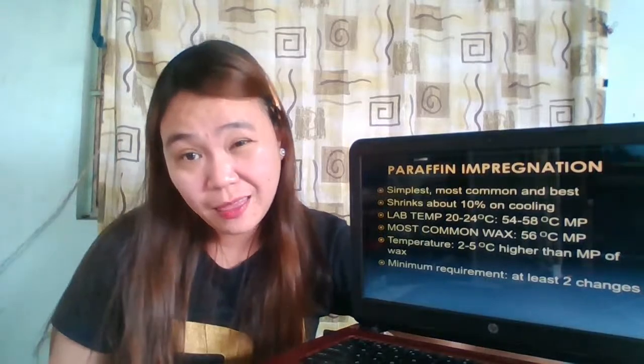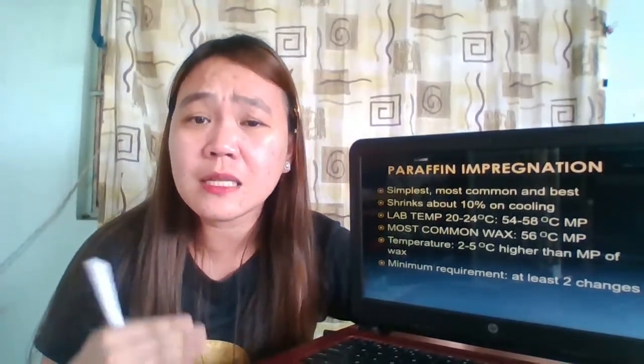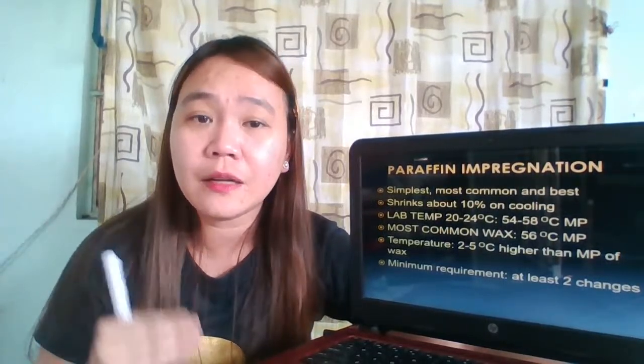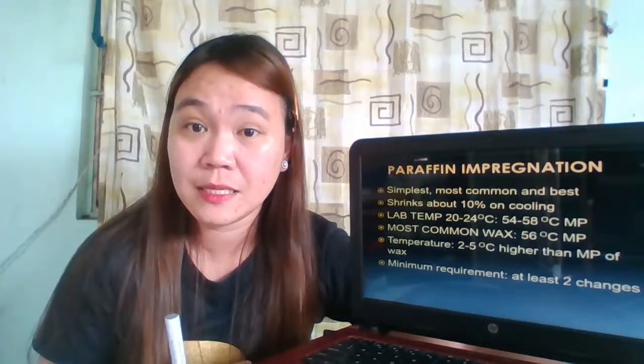That's incomplete, because 2 to 5 degrees Celsius is different from 2 to 5 degrees Celsius higher than the melting point of the wax.